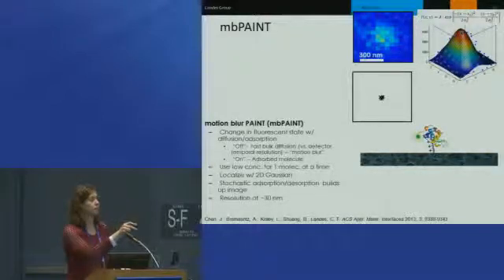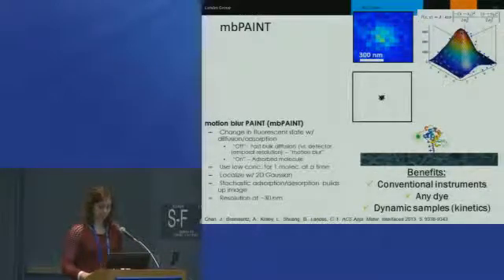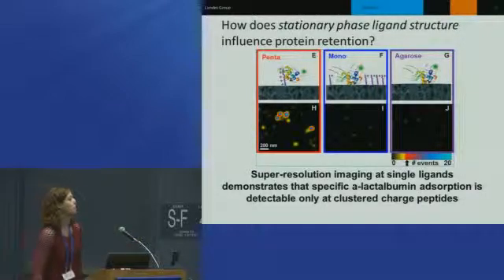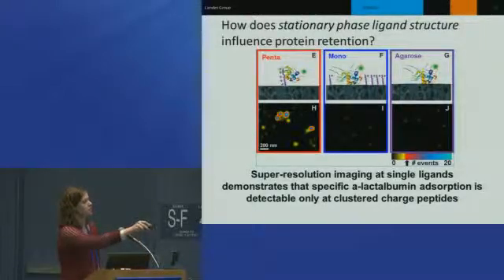And now we're able to image things that are on the order, if you're charitable anyway, of the sizes of our proteins and ligands. And so by using this method, now we can actually analyze our different samples. And this sample over on the right-hand side, and unfortunately here, because of the light and because of the resolution of the projector, you can't see this so well. On the right-hand side, this is our negative control.